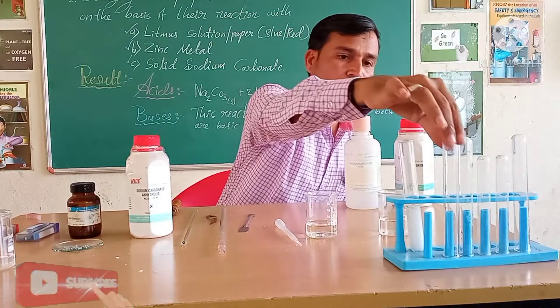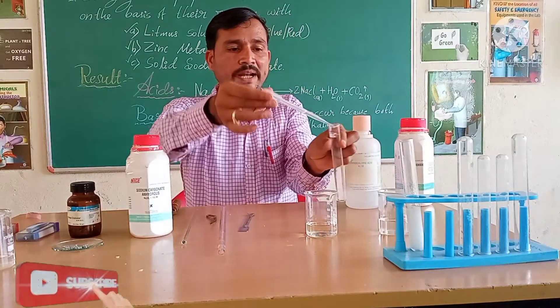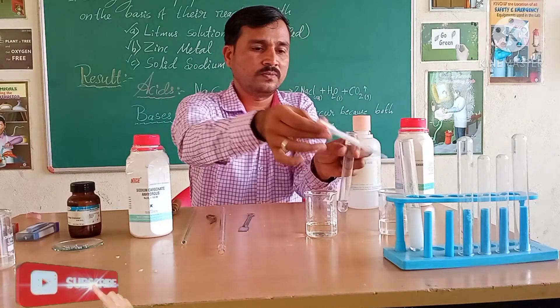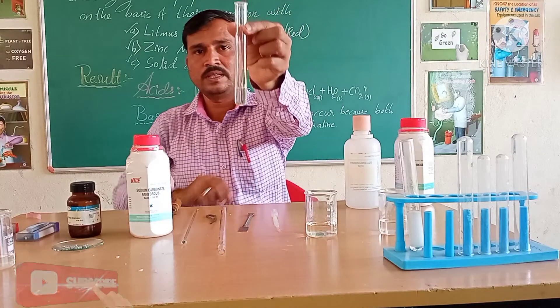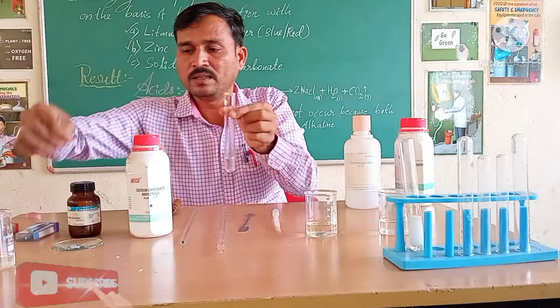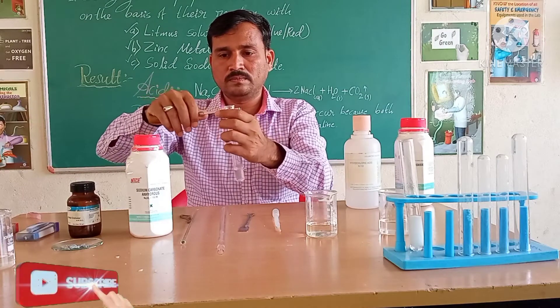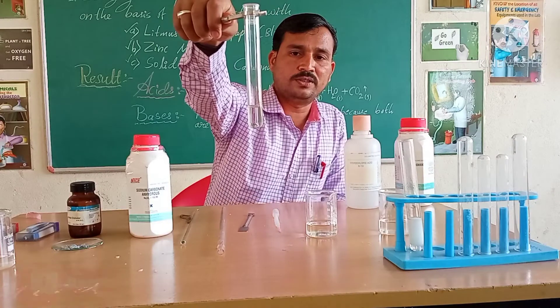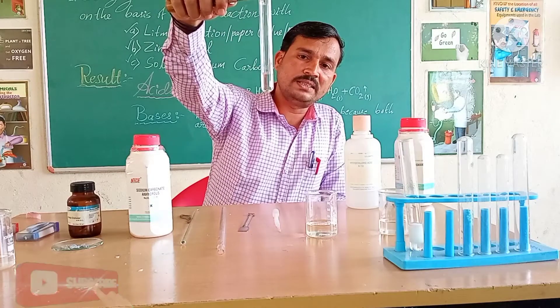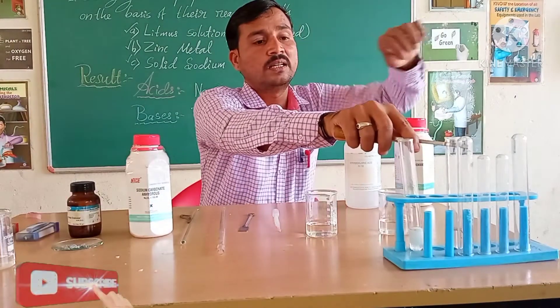Let us study what happens with one more test tube. I will add two drops of sodium hydroxide solution in the test tube. Here is the sample of sodium hydroxide solution. Again we will add a few zinc granules. Let us see what happens. Any reaction? Yes, it is taking a reaction — bubbles are coming out from the zinc granules.